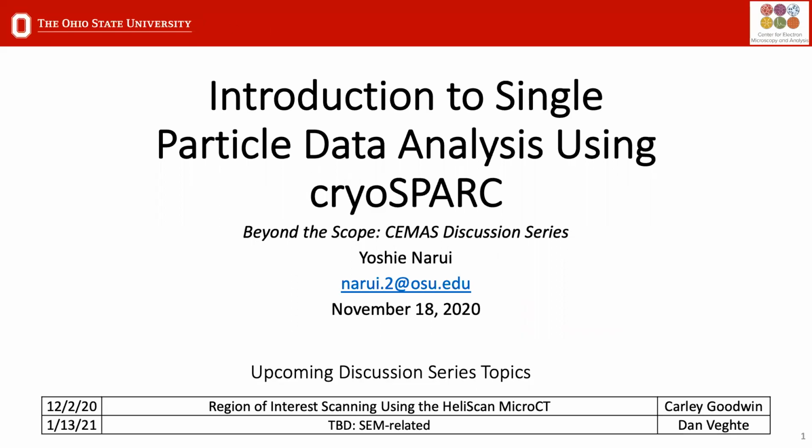Okay, so just wanna make sure, hopefully everybody can see the dashboard now. So this I've just opened in Firefox. There is a computer here at CEMAS that's running the software that's running CryoSPARC, a Linux machine, but I use a web browser to access it. So that's this address here.